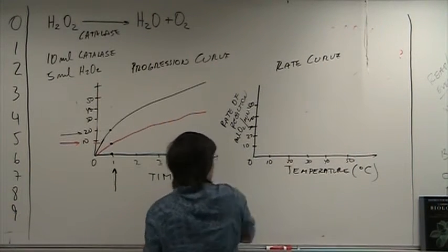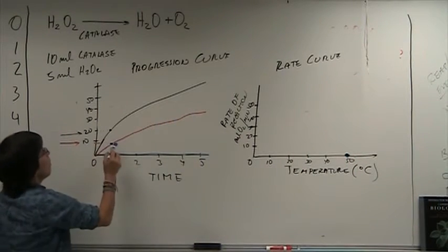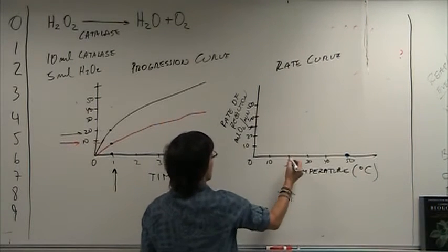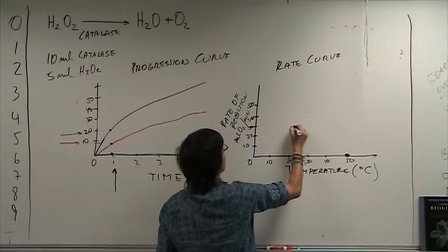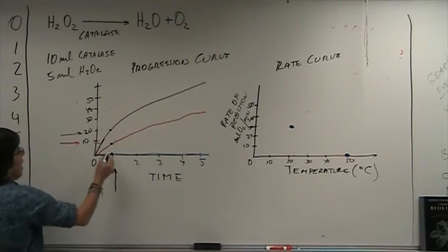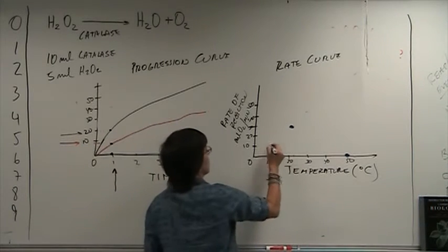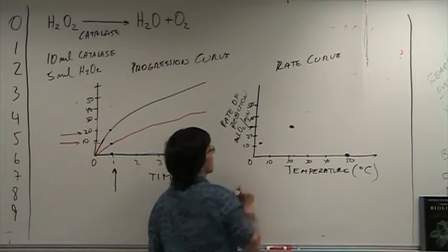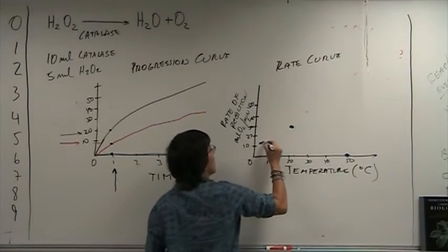because there was no oxygen produced. 50, right there, 0. For 22 degrees, the rate of reaction in the first minute was something like 20 mLs of oxygen, or something in between 20 and 30. And for 4 degrees here, the rate of reaction was much lower. Here is 4. Let's put the dot right there. So when you make your curve, what are you going to see?